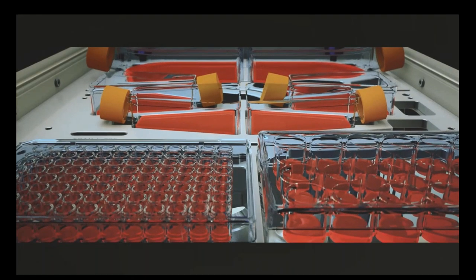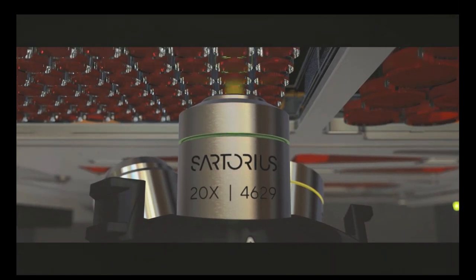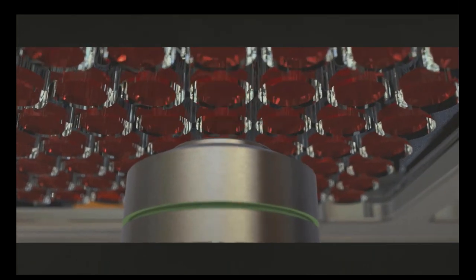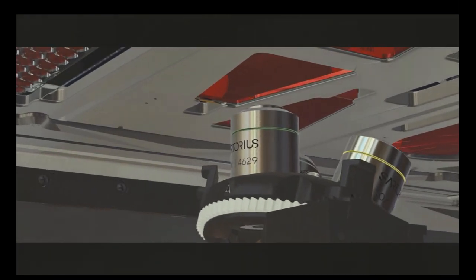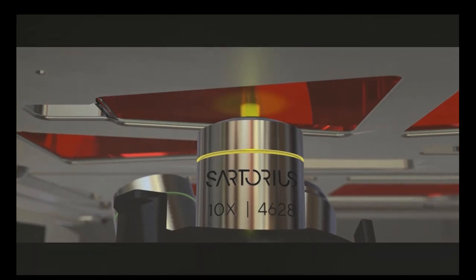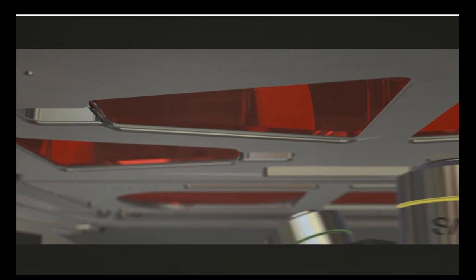Then if we have a look at the cells inside of the Incucyte, the plates actually remain stationary. The only moving part is, in fact, the camera on the bottom, where it acquires images from location to location. The images are acquired in the HD phase channel and then in fluorescent channels. Here we've got three objectives: the 4x, the 10x, and the 20x. And this then allows users to perform imaging on a repeating basis in a user-defined schedule. This then ultimately allows for the acquisition of these very difficult to obtain data points.